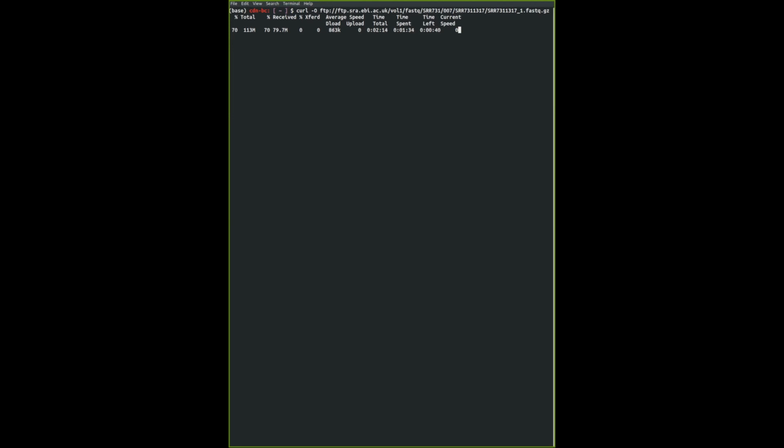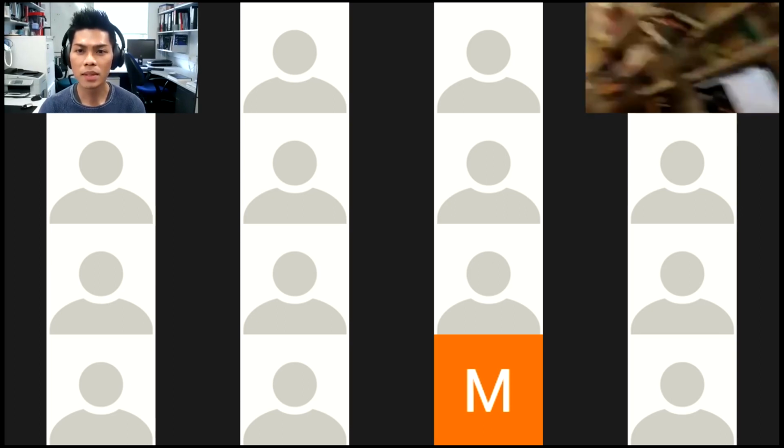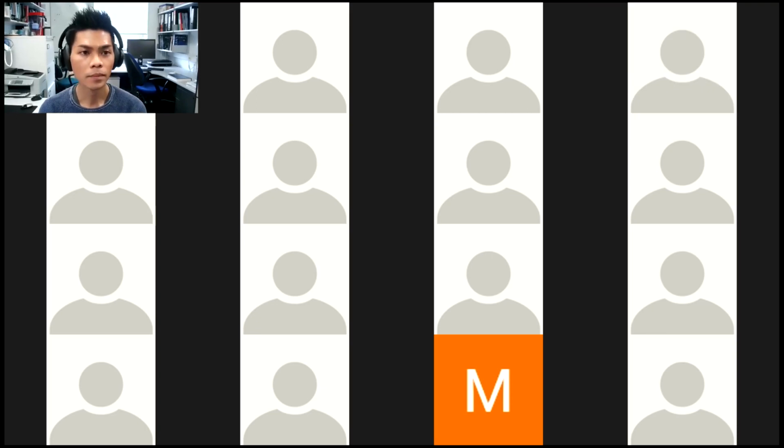Can you share your screen and have a look? Let me see. Yeah, okay. Sure. Okay, can you stop? Can you press Control Z? So you made an error. It's a flag, so dash O. Instead of a dash, I think you put a tilde O. Tilde O will not do a dash O.